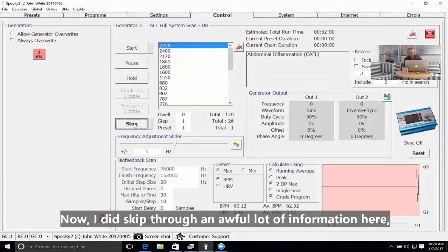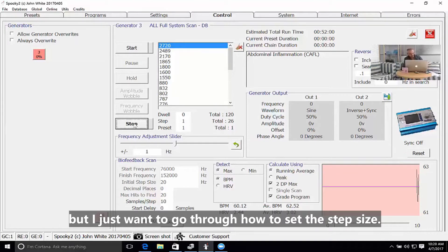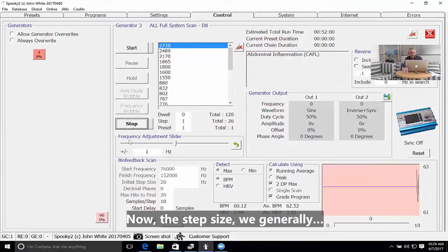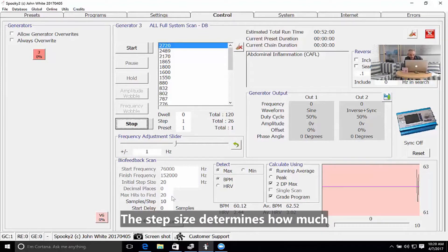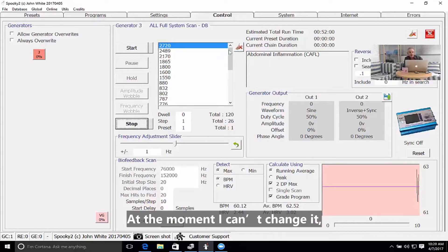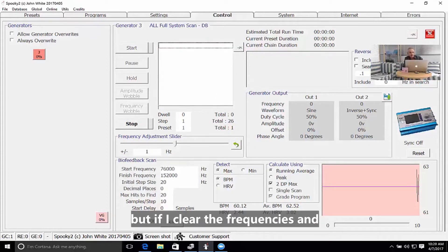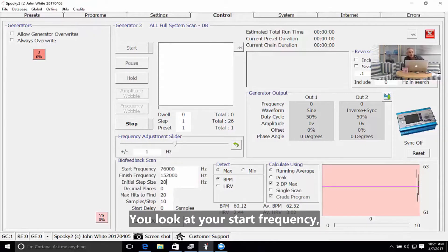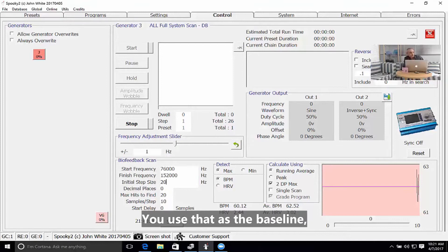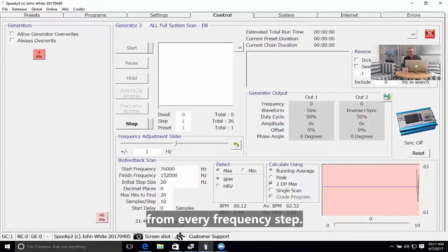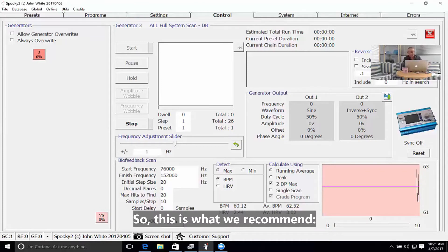I did skip through an awful lot of information here, but I did want to go through how to set the step size. The step size determines how much to increment the frequencies on each pulse. At the moment I can't change it, but if I clear the frequencies, all the fields below here become available. The way to set the step size is: you look at your start frequency, which is the last frequency you used as the baseline, and you want to make sure that 0.025% of that frequency is being hit from every frequency step. This is what we recommend.